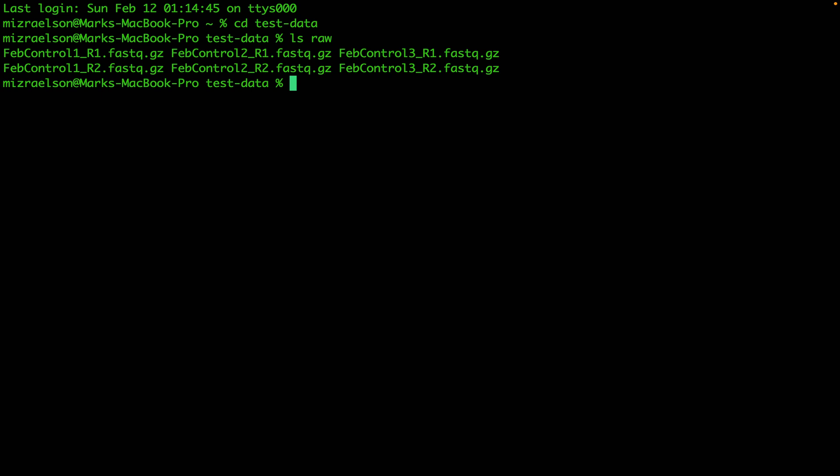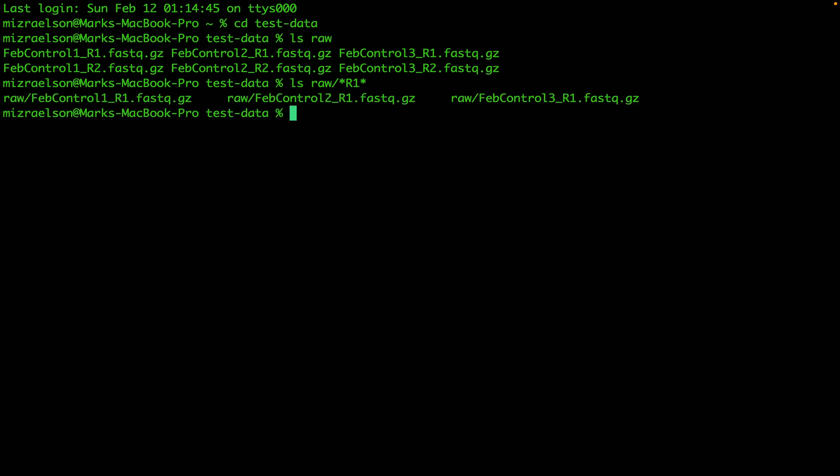We're going to start with listing the files in the raw folder which have R1 in it. You see we have three files with R1, and the idea is that we're going to use that list of files and pass it one after another to MyXER analyze command.